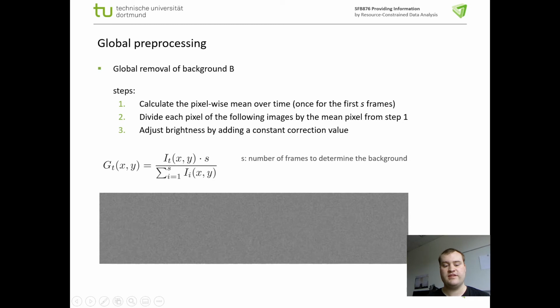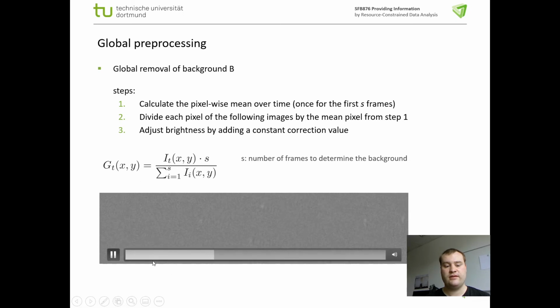Below you can see the result of that. So this is the raw image from one slide before, which was modified with this term. And we can see that some particles appear like this region or this region, and they attach for a long time until the end of the recording.